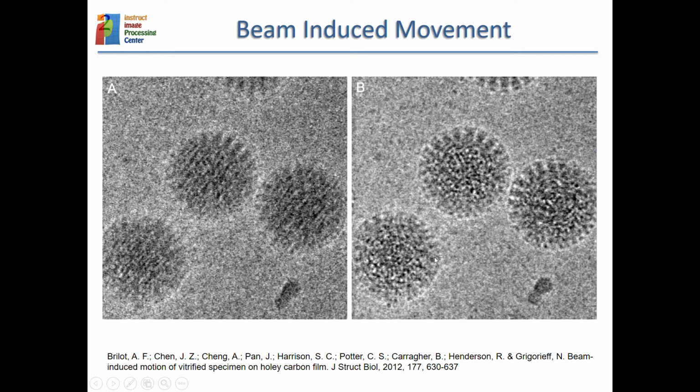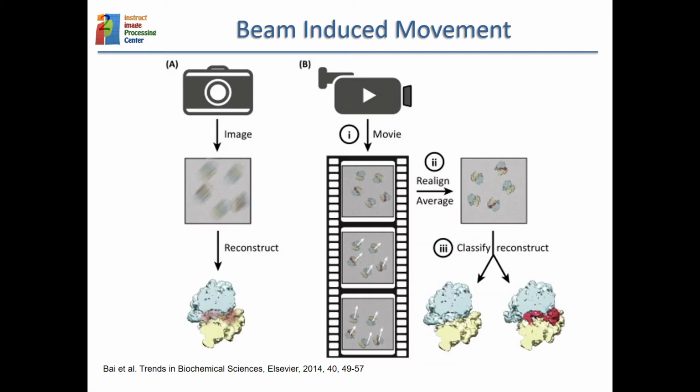So here you would have the corresponding result, where you have much better structural details than if you have 1 second where everything is moving.